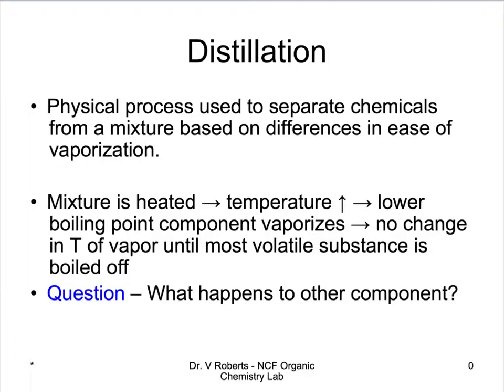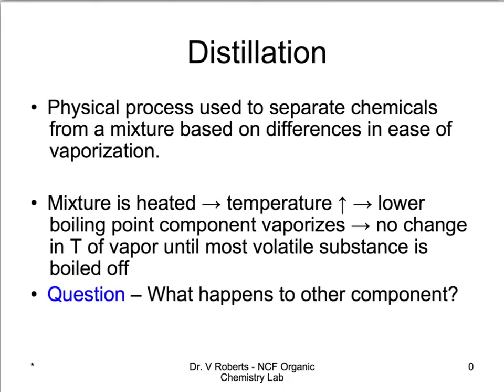Alright? And what happens to the other component? Well, let's think about that. We have a vial with our liquid, and as one component boils off, condenses, and is collected, what happens to the liquid in the boiling pot? It becomes enriched in the other component.